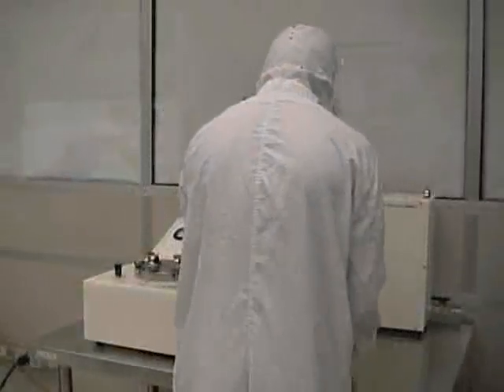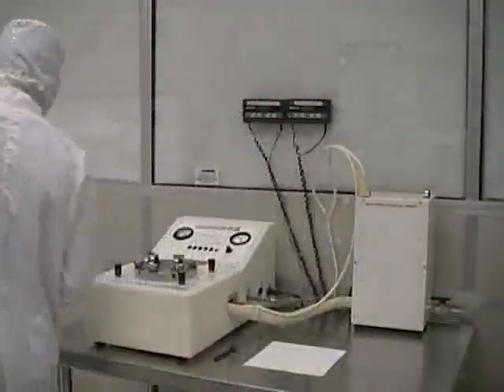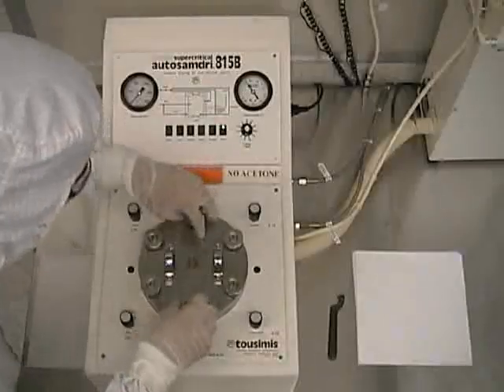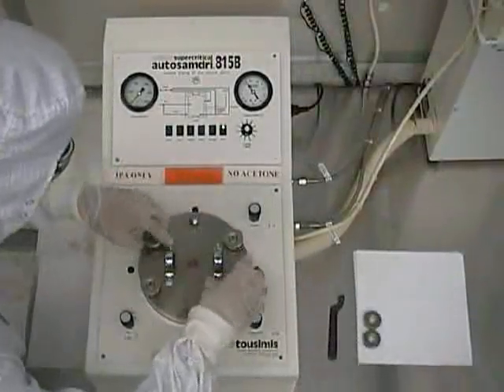Before you begin your processing, you should let the dryer stand for three to five minutes. This initial waiting period will allow the internally heated plumbing components to warm up. During the warm-up period, you should begin preparing your sample for the process. At this point, unscrew the six knurled nuts and remove the chamber lid from the process chamber.